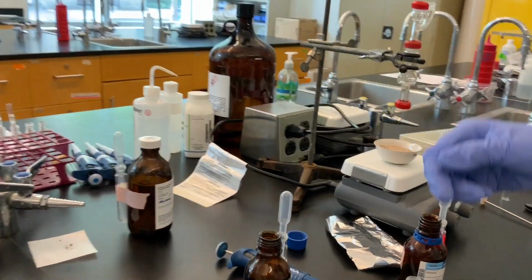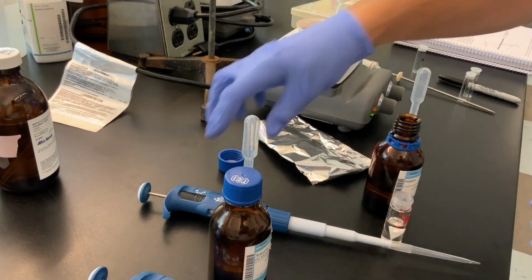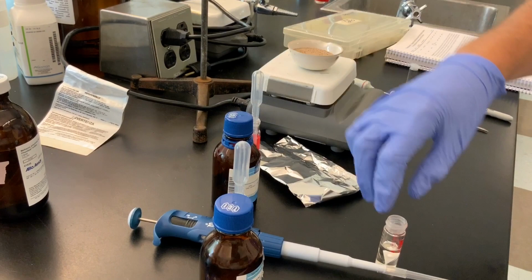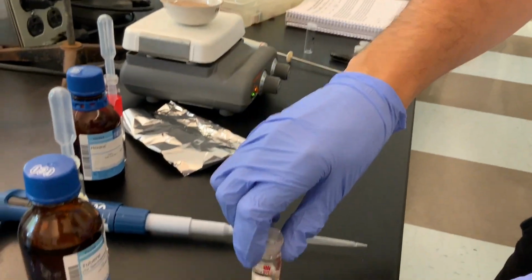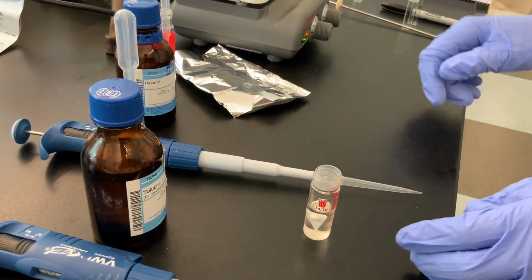That is the other 1 milliliter now added of toluene. So we've got 2 milliliters of liquid in there now. Obviously the vial takes up some volume, so it's higher than the mark, the graduation there for 2 milliliters, but now we're all set to go.